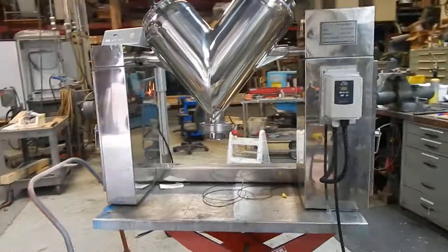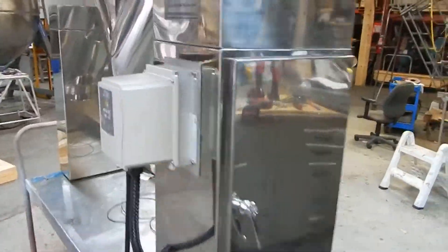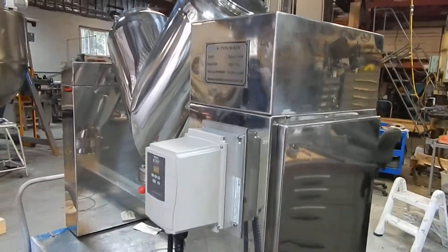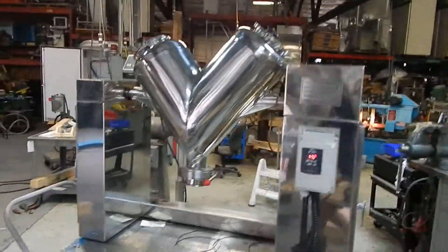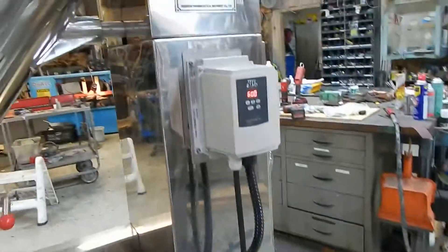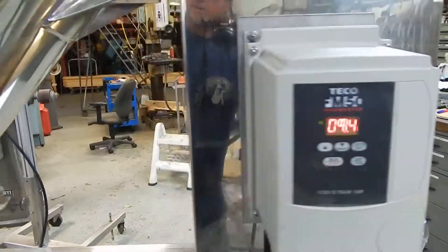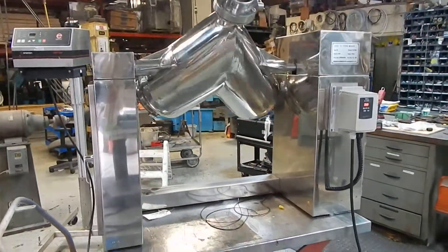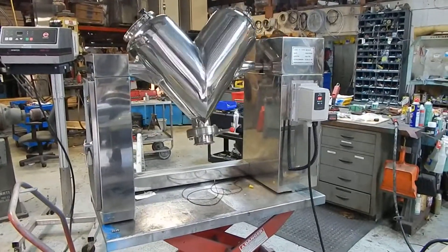We've installed a new drive in it and kept the original gear train. We've gone to an American-made Baldor drive, and we've installed a TECO variable speed controller. The unit, as you see here, is operating on 115 volt. The controller converts the unit to 220 three-phase because the motor is a three-phase design, and having gone to single phase, there wouldn't be enough room inside the housing for that.